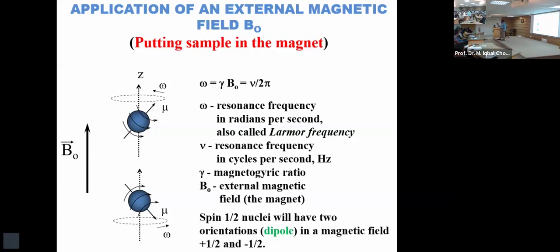Every element would have a different precession because they have a different gyromagnetic ratio. Their response towards the magnet is different, right? Now, but in hydrogen, in ethanol, why is the precession frequency not the same for all protons? The precession frequency is the frequency which needs to match with the radio frequency.